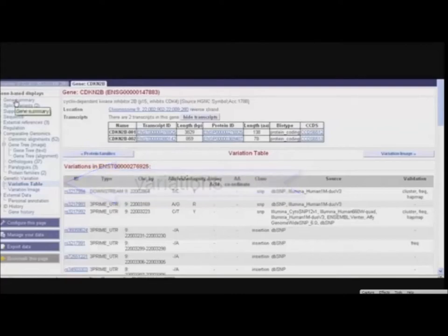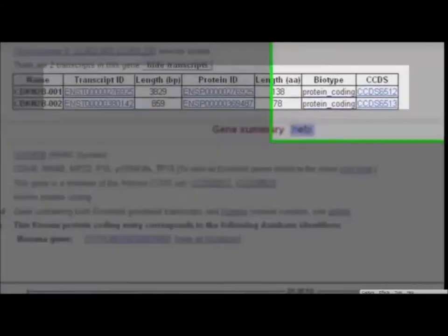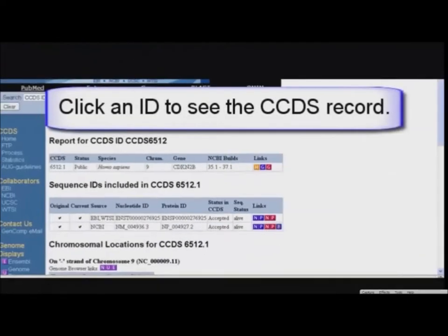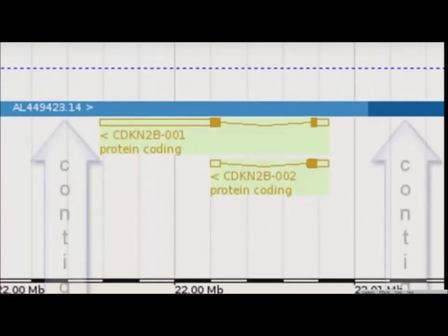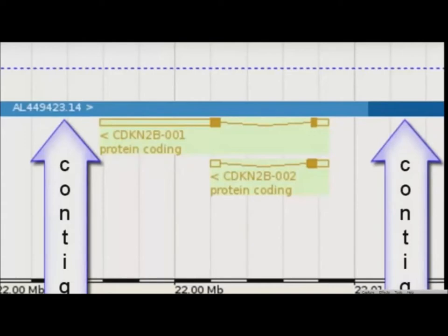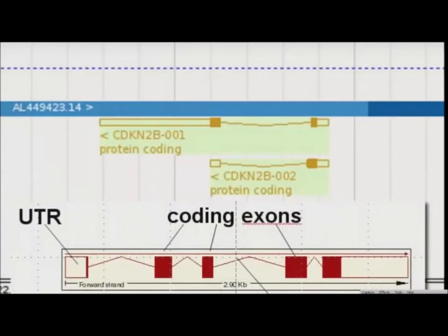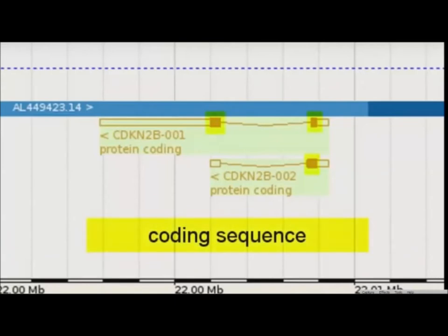Back in the Gene Summary page, we can see that two transcripts have been annotated. These transcripts are both members of the CCDS set, a consensus set of coding sequences established as a collaborative effort between NCBI, Ensembl, Vega, Uniprot-SwissProt, and UCSC. Further down, we see the transcript models. The contig reflecting the genomic sequence is displayed as a blue bar. Transcripts above the contig are on the forward strand; if drawn underneath, they are on the reverse strand. Boxes are exons, and lines connecting those boxes are the introns. Boxes are filled if they contain coding sequence. Unfilled boxes represent UTRs, or untranslated regions. The two transcripts for the CDKN2B gene show coding sequence and are on the reverse strand of the genome, underneath the blue bar.